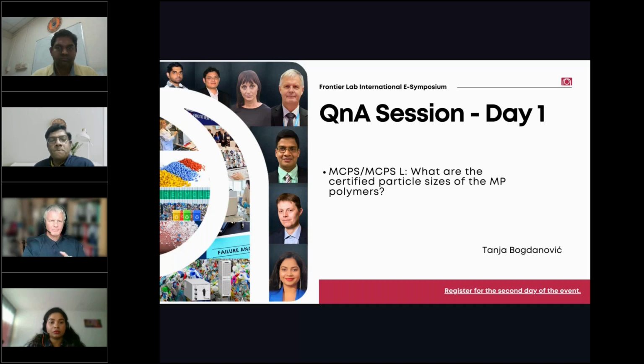Any other comments? I think at this moment that is the best answer. In general we can say the particle size of our standards is around 30 microns. Some of them we dissolve and put onto the particles, so they are attached to them. So in terms of the particle size, that's the range.